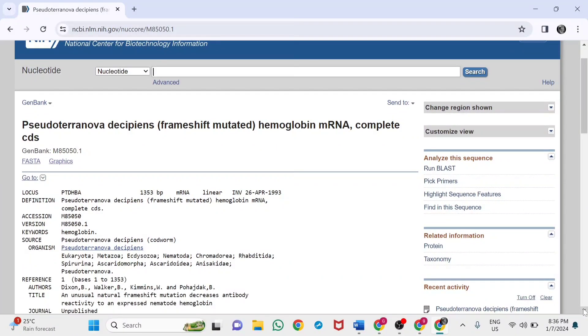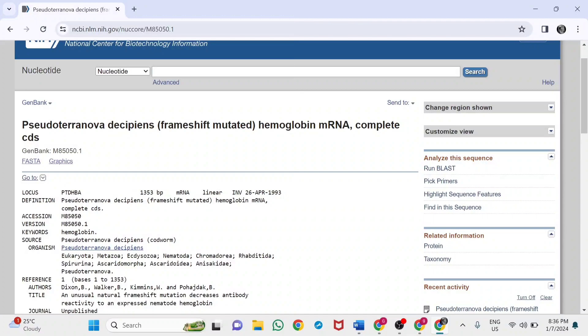This is the GenBank accession number. GenBank is the database where several nucleotide and protein sequences with supporting bibliographic and biological annotations are built and distributed by the NCBI.